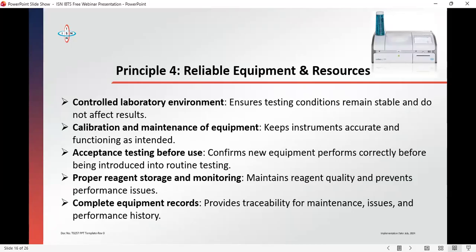We need to have a method of monitoring the reagents and storing them. Temperature monitoring cannot be overlooked, and we need to have evidence that we are doing this. Some people have real-time monitoring devices. Some use the manual method of sheets on Excel. If you say you don't want to use paper, you can document it, but ensure that somebody is looking at it, not just signing off the temperature. There are reasons why you need to do that. Because if you don't, those reagents are what you will use on your instrument to produce inaccurate results that may lead, in the worst case scenario, to somebody's death.